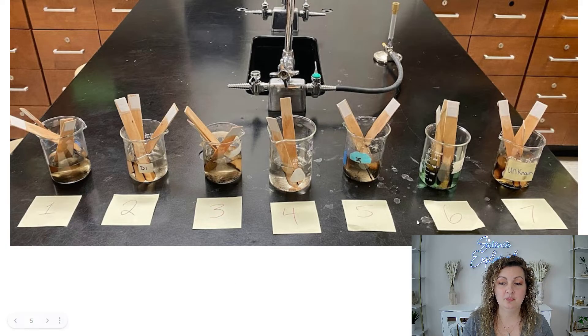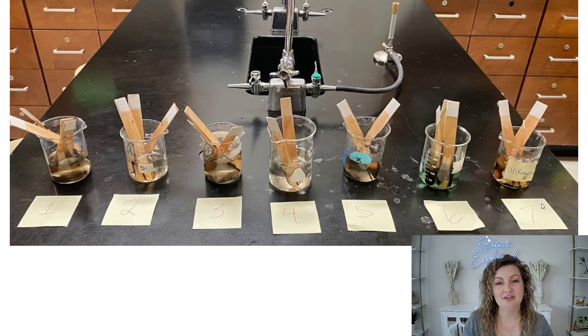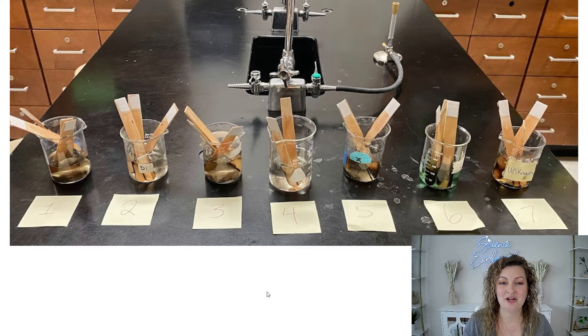So I go ahead and label them one through seven. Seven is going to be our unknown. In other words, we're going to test six different chemicals, but then our seventh one will be a repeat of one of these, and I need you all to figure out which one it is.